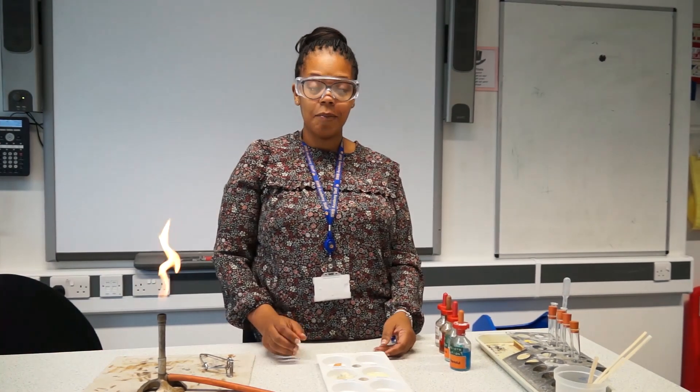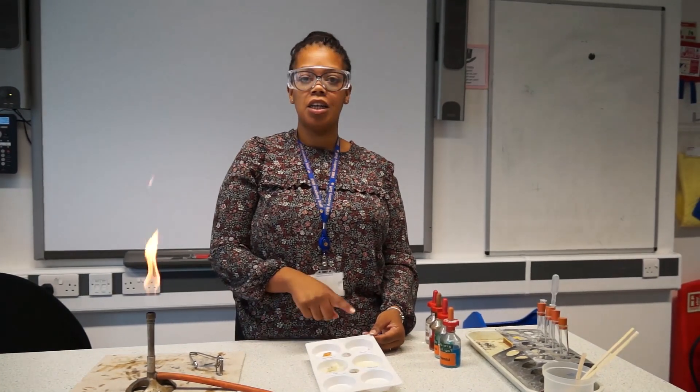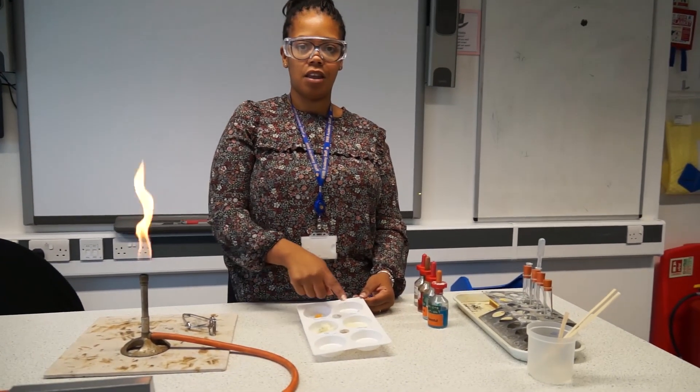Hello, I'm Miss Rutte and I'm here to show you food tests. So we've got a selection of foods. We've got bread, sweets, egg and olive oil.